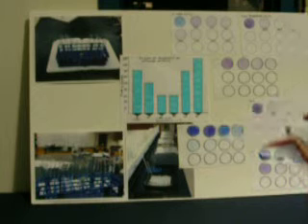The positive control is room temperature. The negative control is not putting amylase into the solution. The controlled variable is each solution was placed in a set temperature warmer.